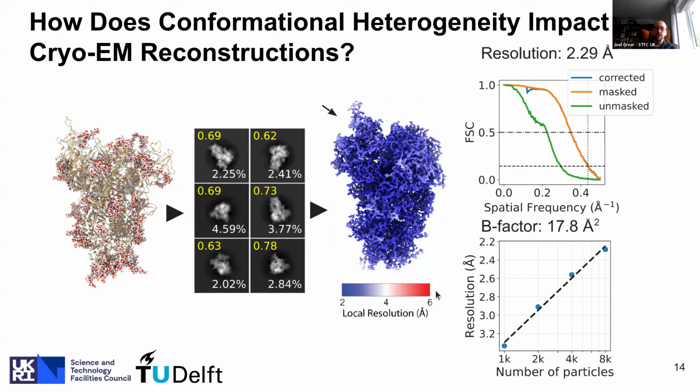We also compute the local resolution here using the ResMap program. This is essentially a per voxel estimate of the wavelength that a local feature is present at, and this is determined statistically by performing a likelihood ratio hypothesis test between a local sinusoidal model with that wavelength against the background noise.